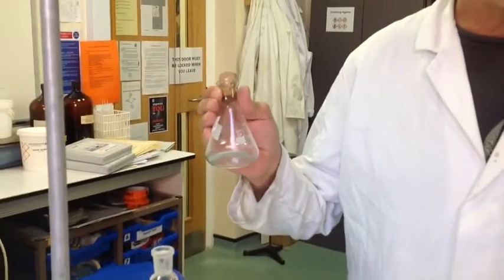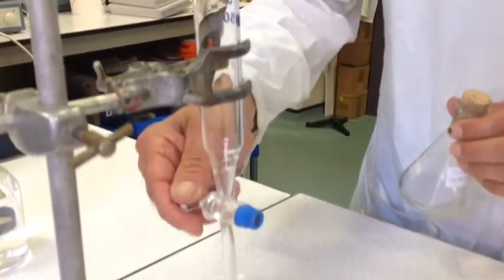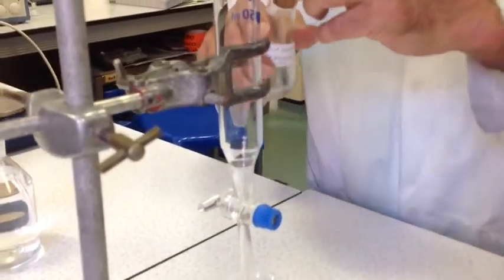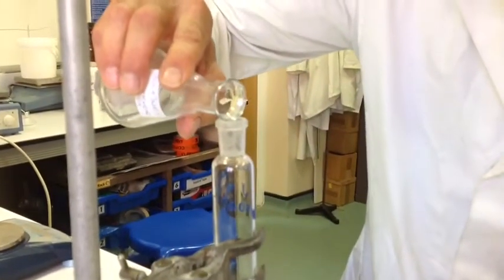Hello again. Today we are going to be carrying on with the second part of the practical preparation of cyclohexene. So I'm going to take my product from last week. I'm going to add it to a separating funnel. Before you add it to the separating funnel, please make sure that the tap is closed. So I will tip that into the top.